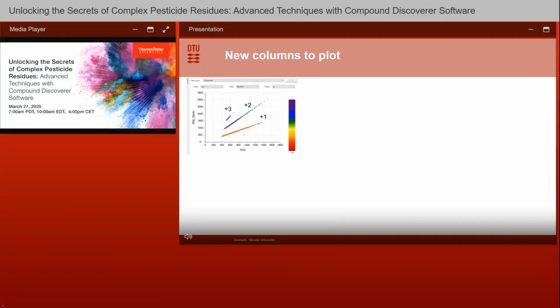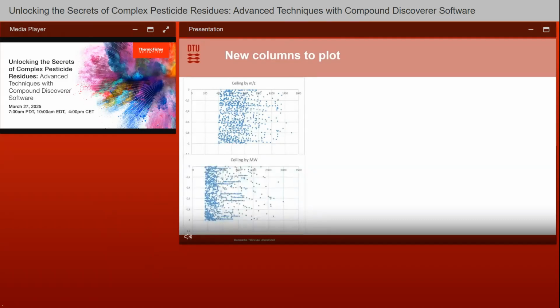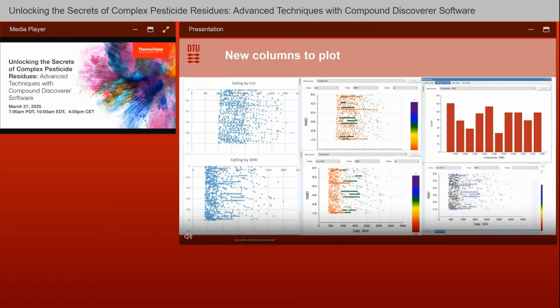With the new columns, we can easily take apart the charge states, plot any of the variables using the colored third dimension, and the scattered cloud, originally with m/z, will become interesting by plotting the molecular mass instead. Even more by using the ceiling rounding, we can see them jump up the plot. Also, we can get other metrics as well as cross-check with other variables like the retention time to easily select each feature.